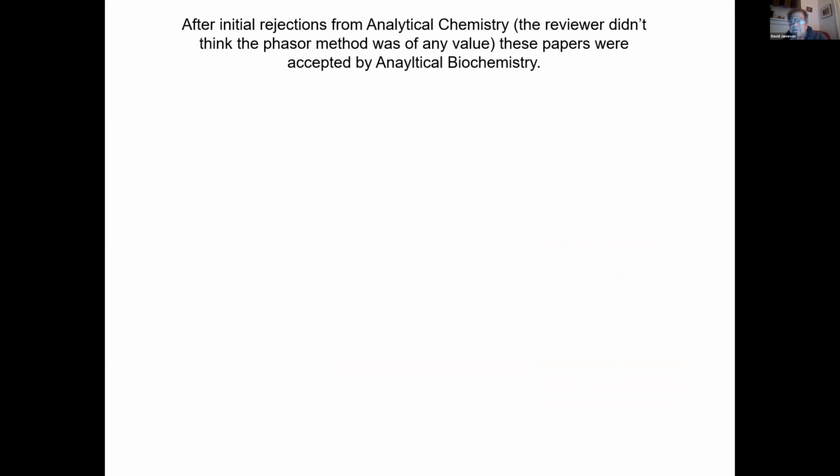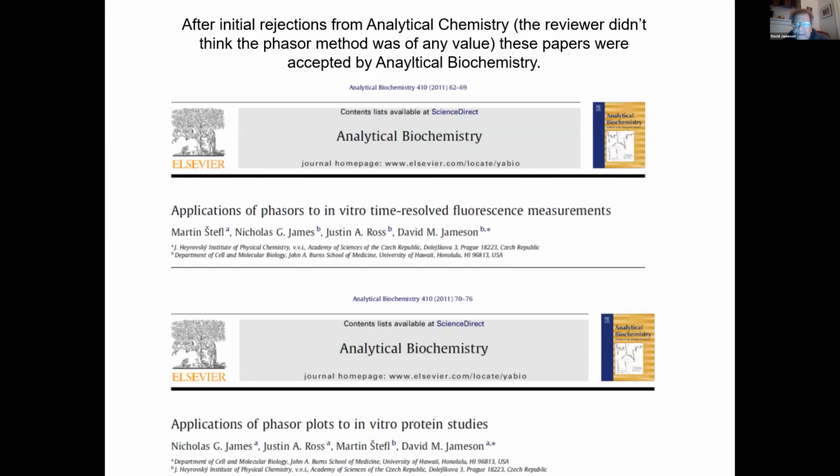I'm going to show them because you guys won't see so much phasors in cuvettes, but it's still very good for these type of measurements. And I think it illustrates the power of the phasor method. This paper was originally rejected from Analytical Chemistry because the reviewer didn't think the phasor method was of any value. But fortunately, it was accepted in Analytical Biochemistry.